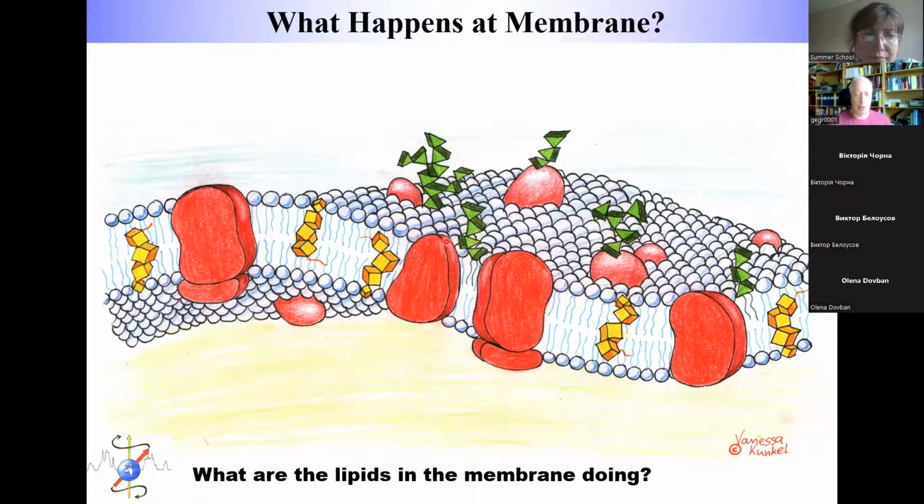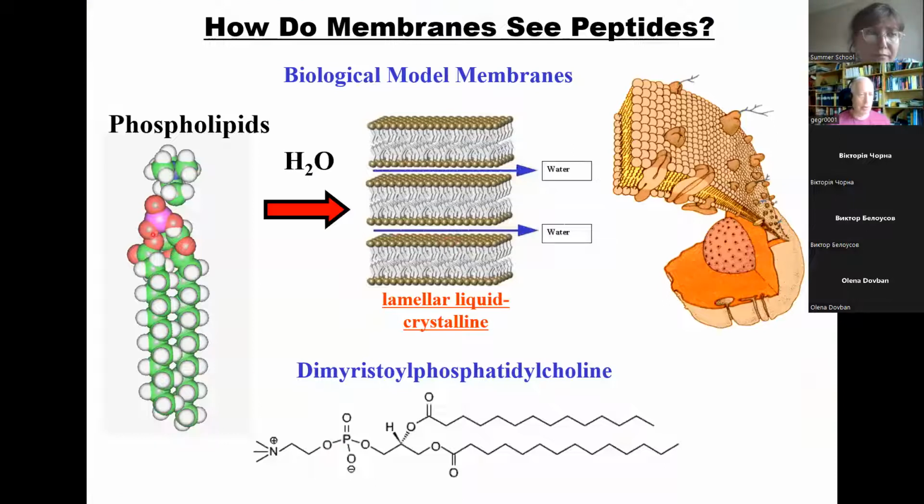And so what is the advantage with lipids? You can buy them in large amounts, isolated. It's like DMPC. My whole PhD thesis was made on DMPC relaxation with NMR. If you put them in water or buffers, they spontaneously make bilayers. So you automatically have a nice bilayer, which is like in the real cell membrane, the plasma membrane, and all the other organelles. So it's a very nice, simple system.